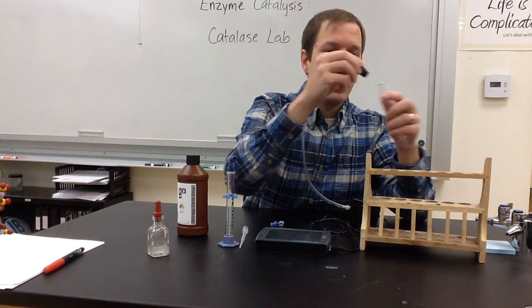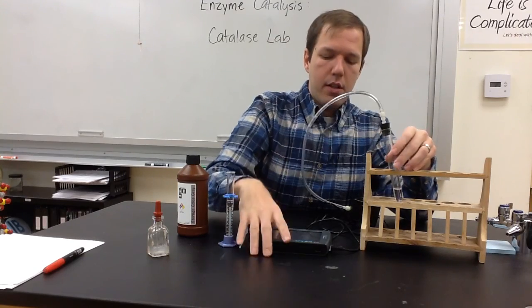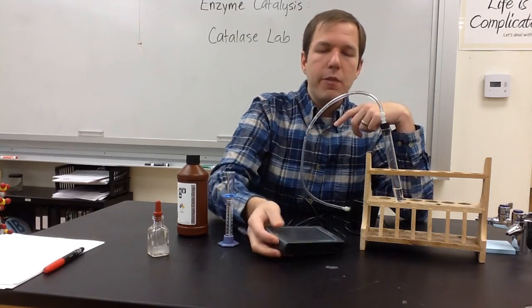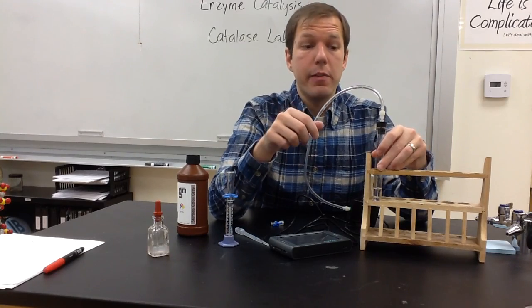And then finally, secondly, you should then add the test tube stopper and start data collection by hitting the green arrow on your LabQuest. All of those things need to happen in very quick succession in order to increase the accuracy of your results.